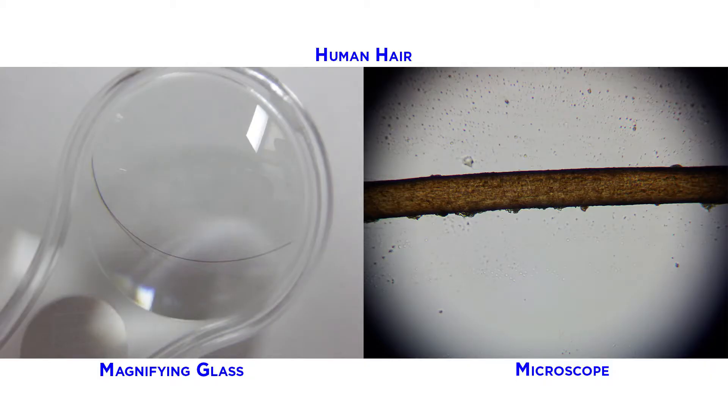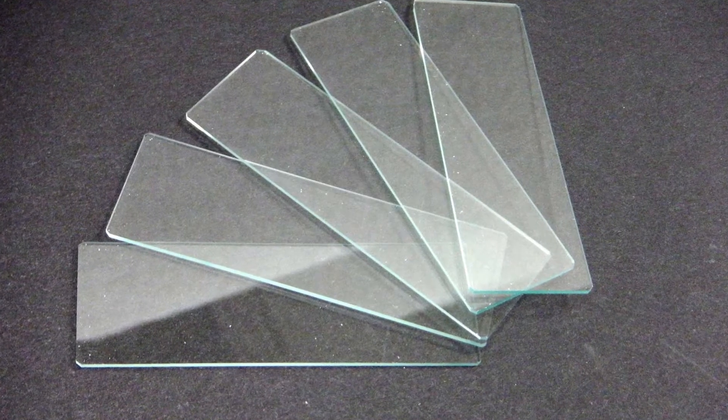Microscopes help you see things that are too small for you to see with the unaided eye. However, a microscope is different from a magnifying glass. Slides are necessary when you use a microscope.